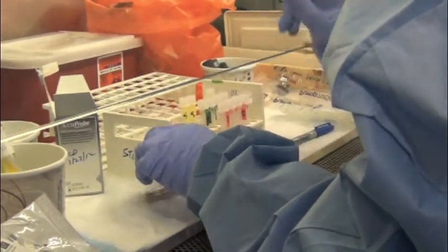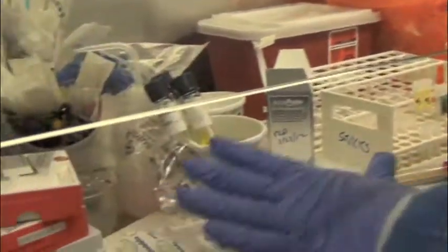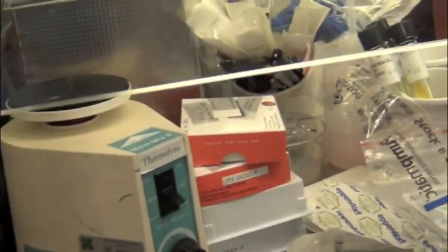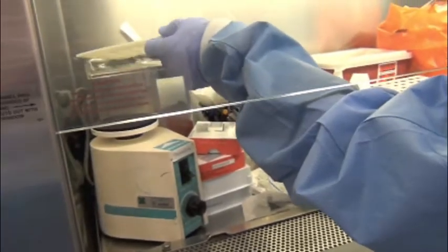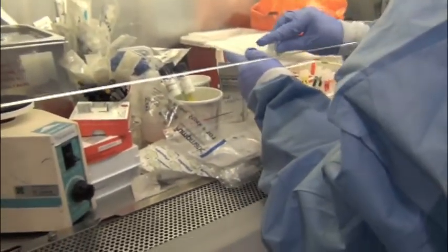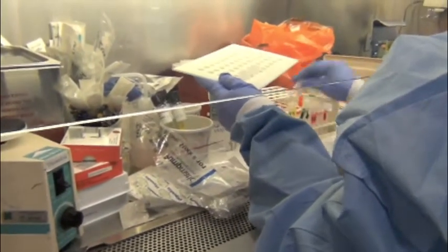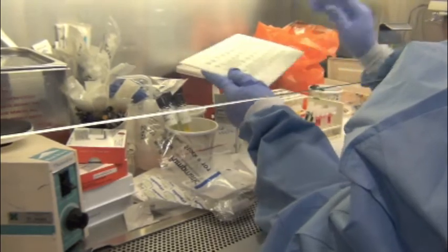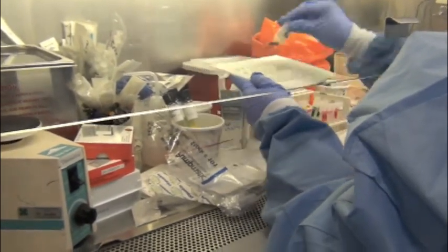Okay, now the next step is to vortex these, and the vortex machine is right over here. We're going to vortex these for about 10 seconds. Now the next step is to sonicate these. I have a sonicator, and this is going to go for 15 minutes.